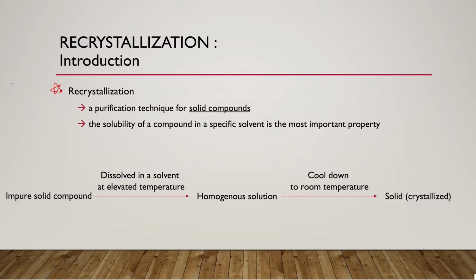But recrystallization is only applicable for solid compounds. And the solubility of the compound in a specific solvent is the most important property that we need to know to perform recrystallization.